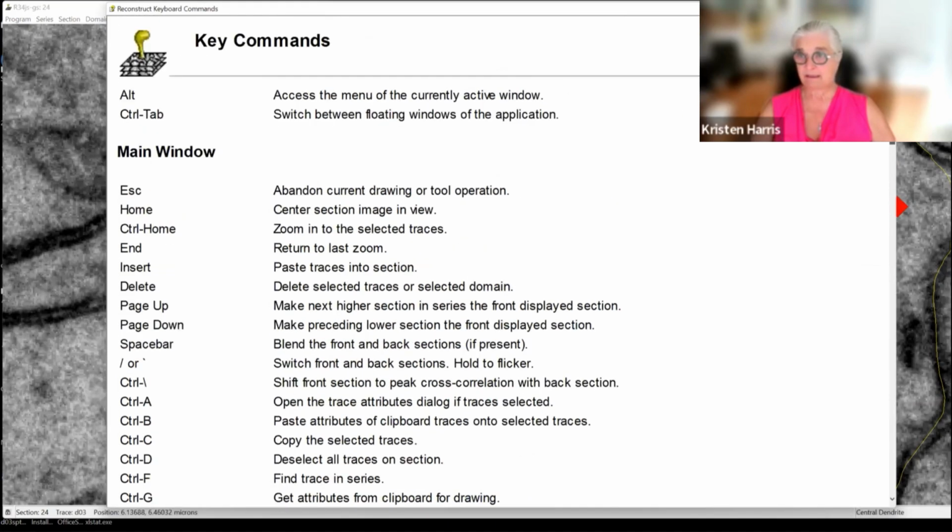So anyway, there's a lot of cool things in here that are going to be implemented in Reconstruct Plus, but some of them you might want to just implement in the NeuroGlancer environment, and Reconstruct just makes a call to them. Does that make sense, Edwin, the way I'm talking about this?